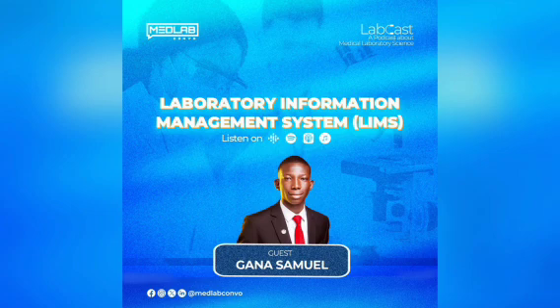So we'll be moving into our this-or-that segment. Manual sample logging or automated LIMS logging? My dear, for someone who has seen what automation can do, I think automated sample logging. Okay. Paper results or digital result release? Digital results, please. You can misplace paper, and it happens a lot.